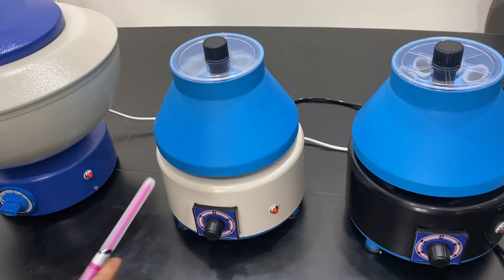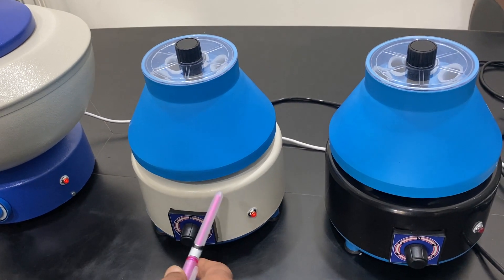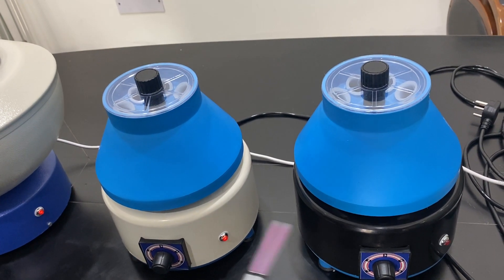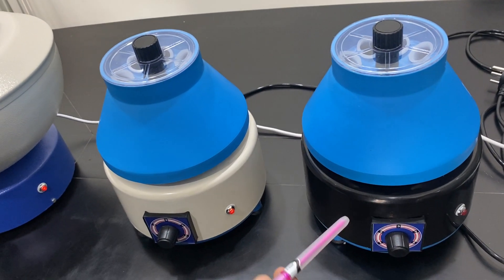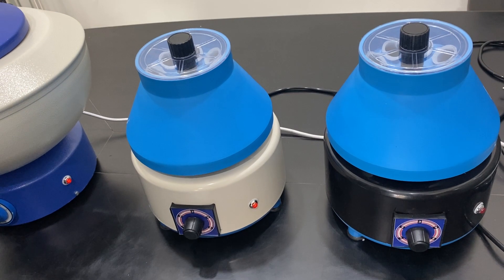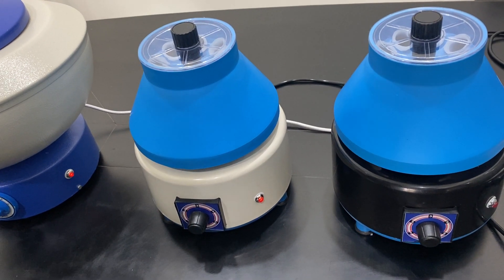Maximum speed is 3500 RPM for both our standard models. We also have a model with pure high-quality copper windings, and another more economical model. We also have a digital model with digital RPM display up to 16,000 RPM, and a refrigerated centrifuge model as well.